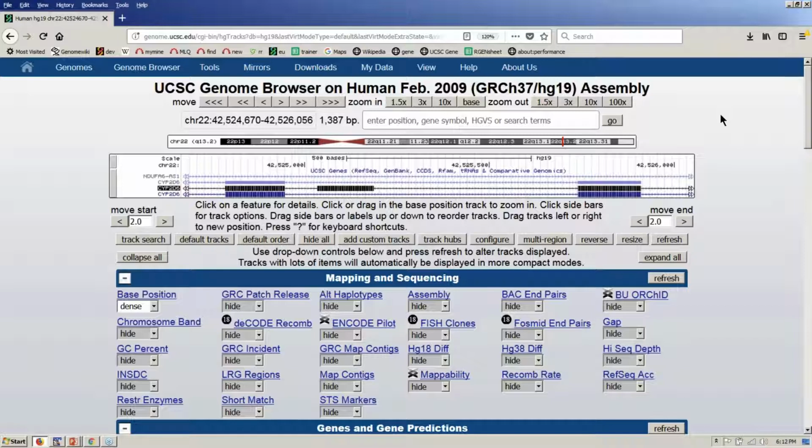So where I had intended to go with this was to grab primers from both ends of the gene here and show you the 2 modes of ISPCR, one which would give us the DNA in this region, and one that would give us the products that would be there if we had done a PCR amplification using RNA as a template. In that case, these 2 different isoforms give us different size products, and ISPCR will give us those products.